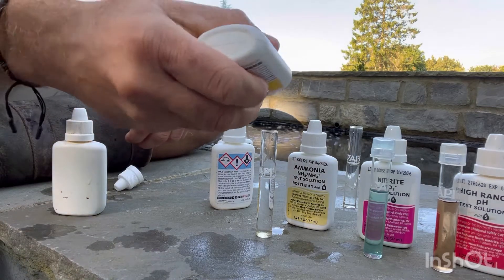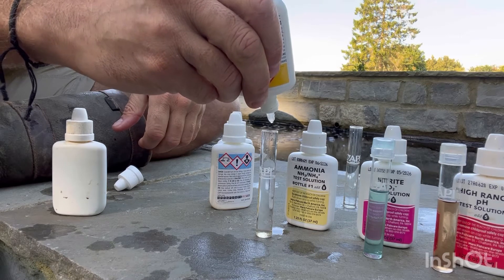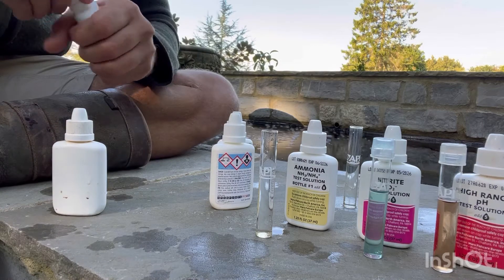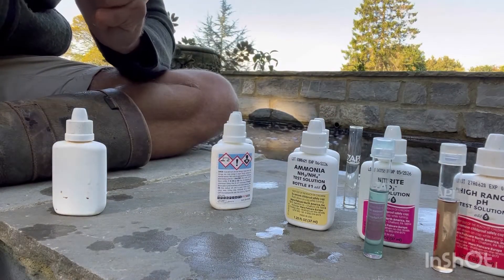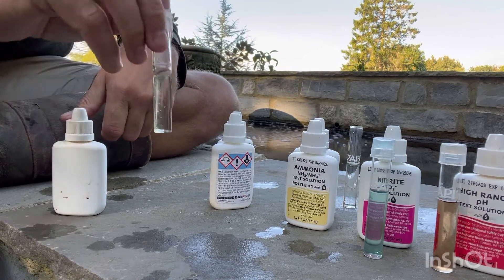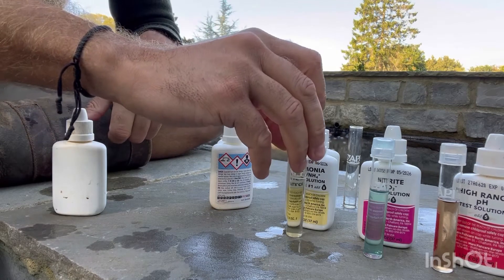Another eight drops of bottle two. You have to be careful — the viscosity is different on that one so it comes out really easily. Ammonia looking pretty good.